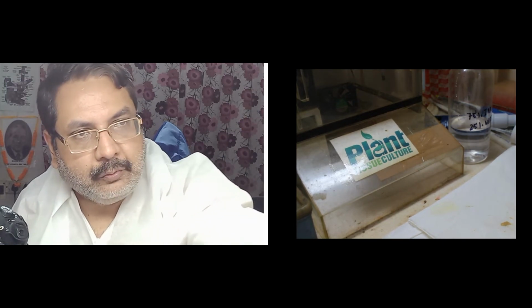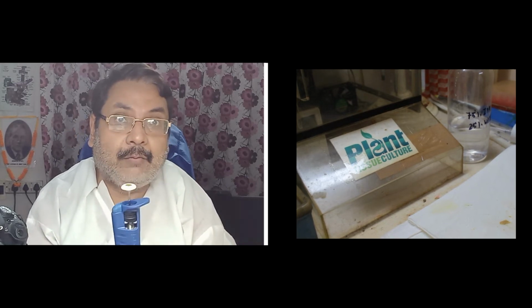So another auto pipette is there. This is a very small auto pipette, and this is the biggest auto pipette. It works the same way. This is a 5 ml auto pipette, 1 ml to 5 ml. Now this is the big one. We are talking in milliliters now: 1 milliliter to 5 milliliter.